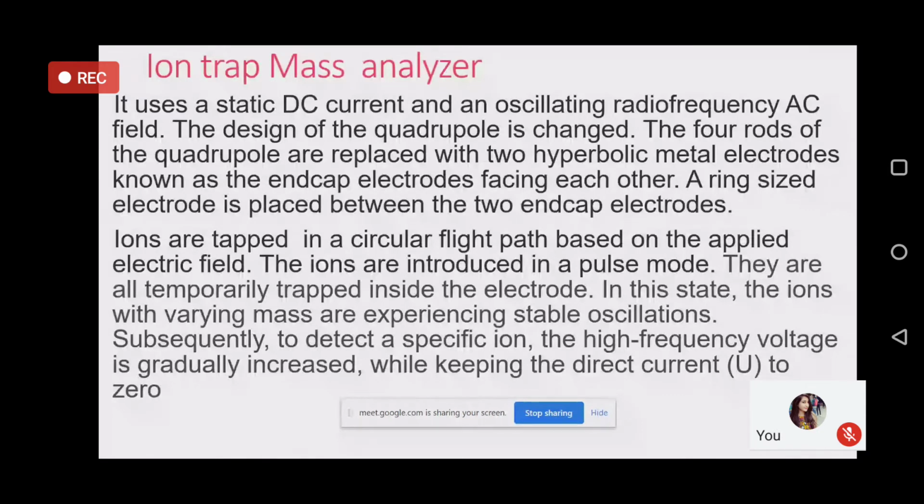And it is the voltage that is applied to the positively charged ions that will decide what is going to be the velocity. Because the energy input is V into E. V is the applied voltage, E is the charge on the ion, or Z, V into Z you can say. Z is the charge on the ion, V is the applied voltage. That is equal to 1/2 mv². Now for m by Z, it will be V upon v², capital V upon v².